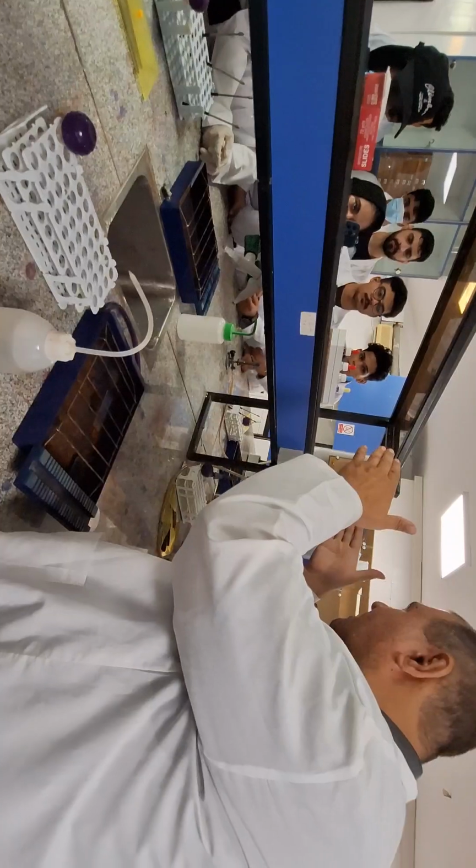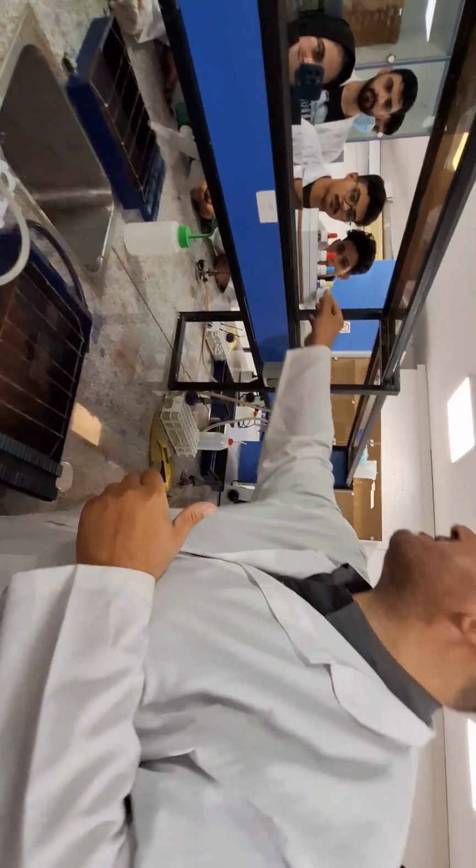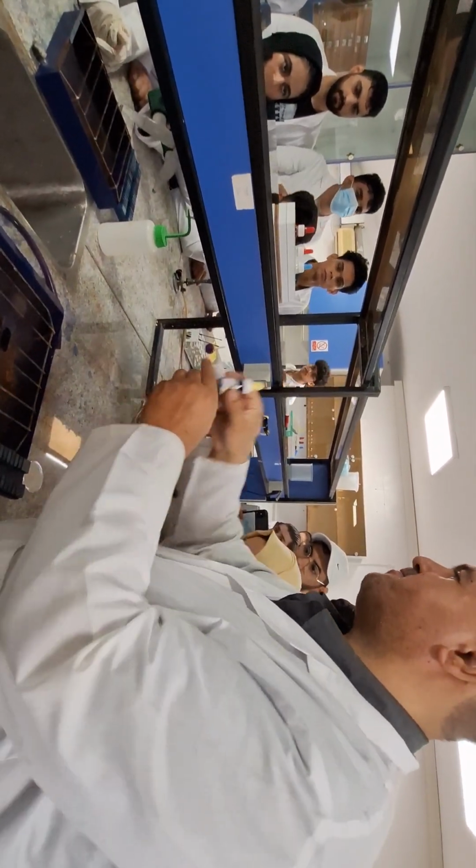After fixation in gram staining, the first stain is crystal violet. Flood the bacterial smear with crystal violet. The time is 1 minute.